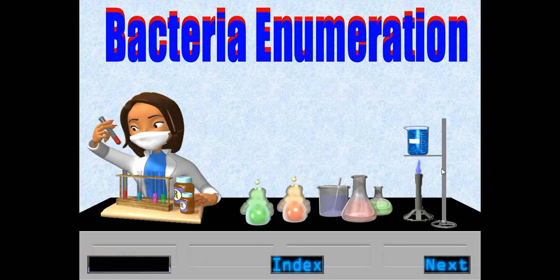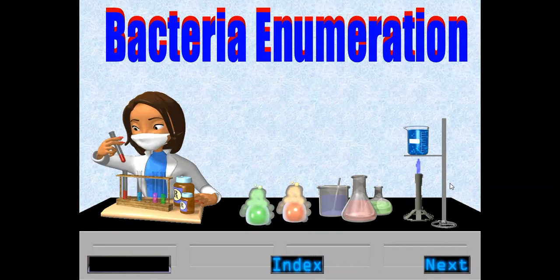20F1036. Today I want to show you how I perform a bacteria enumeration lab simulation.